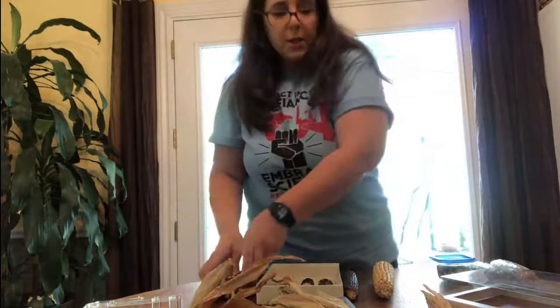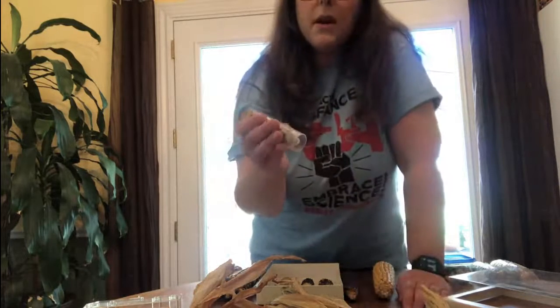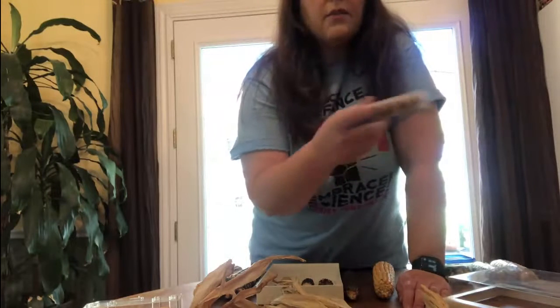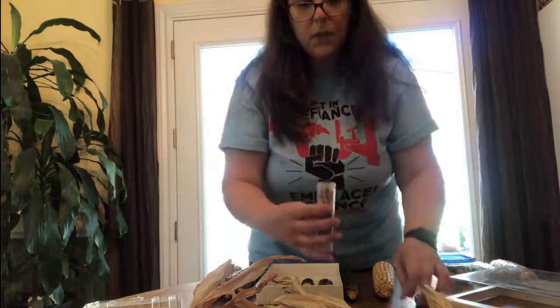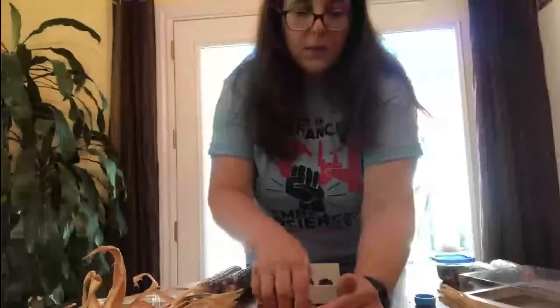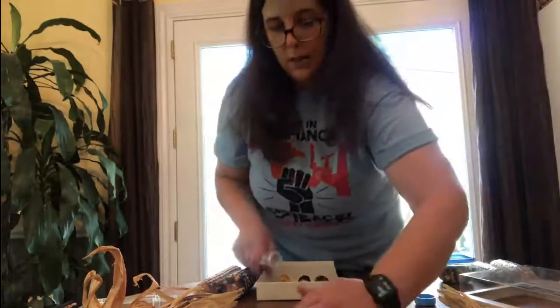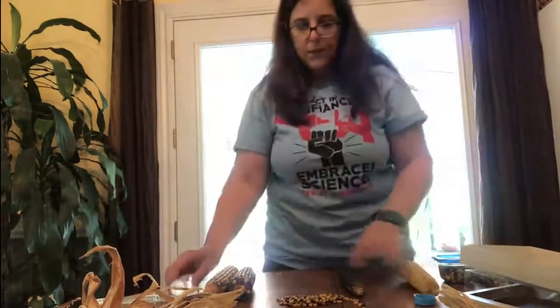So in the very first experiment for the monohybrid cross, what you would do is you would take your sample, and I have a sample for all of the groups. Obviously, you're not going to be able to count these yourself. I'll make some room here. But the procedure would be just basically taking the kernels, and you can't see that in that video. It's kind of off screen.